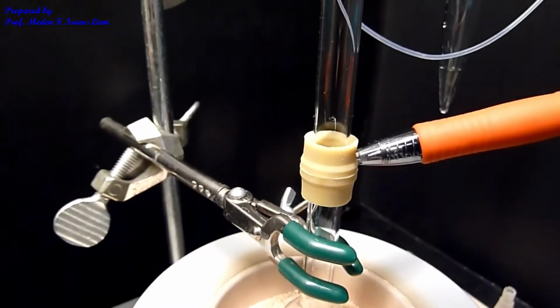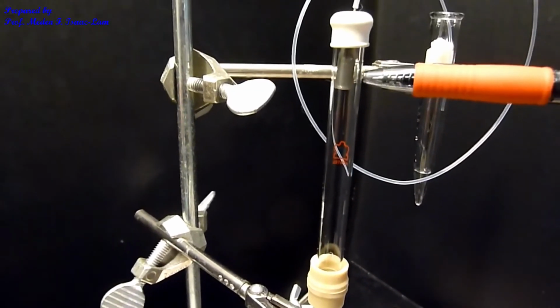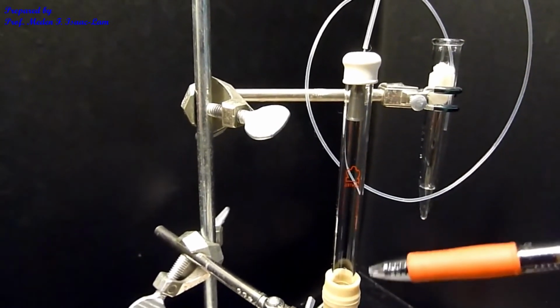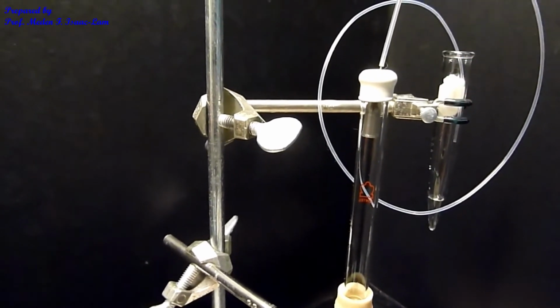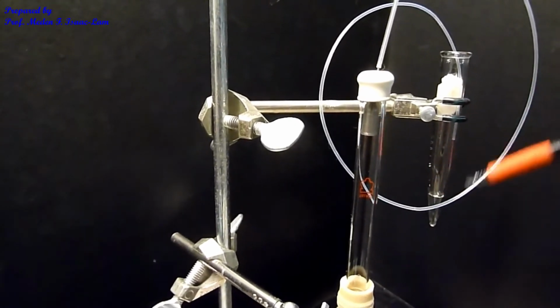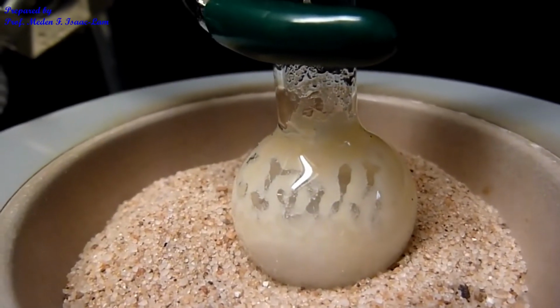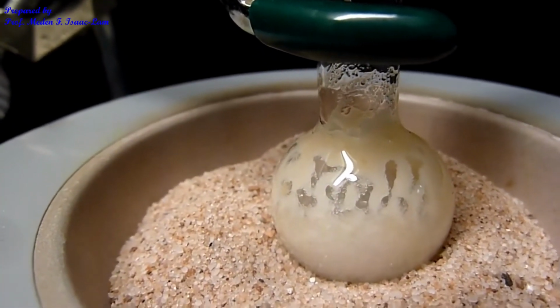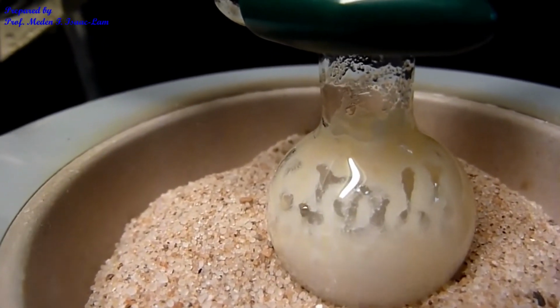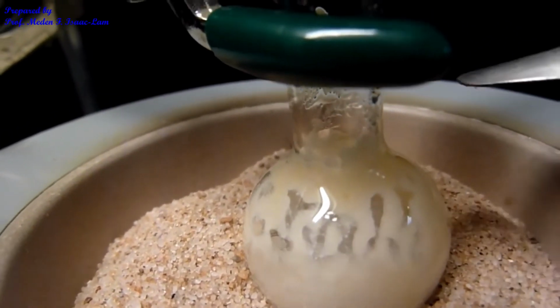So this is the adapter, and then I have the air condenser so it doesn't dry up, and then I have the needle, so it's not entirely enclosed because I have the outlet to the Teflon and then into the trap, which will collect the HBr that is coming out from the reaction mixture. So you can see the bubbles right now, so I increased the setting for the transformer to about 45, and now you can see the bubbles forming, but I want to watch the bubbling so that it doesn't go up and it stays at the bottom.